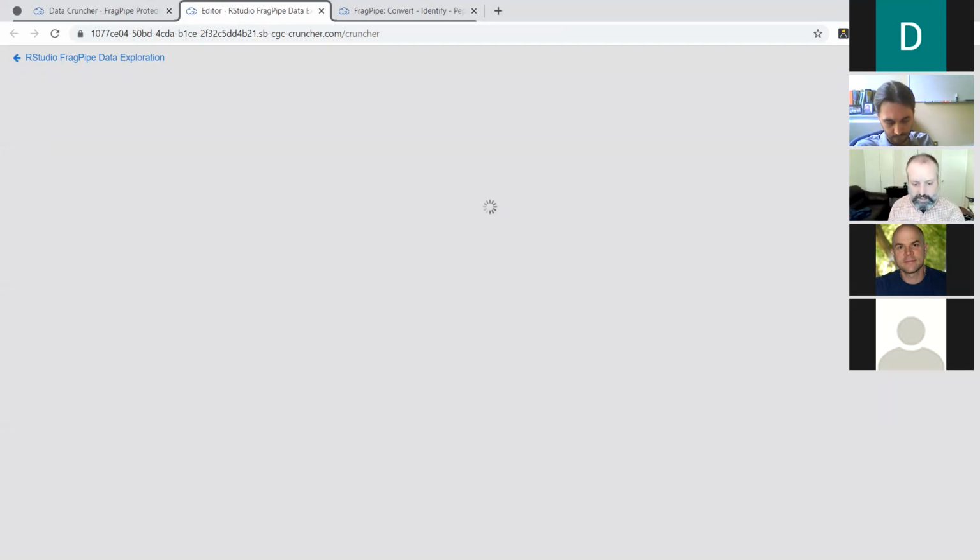So what else is on the agenda? So we have walking through the notebook here, and then looking at the PDC website, which will probably end on that.